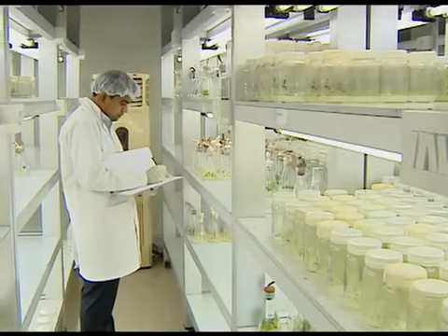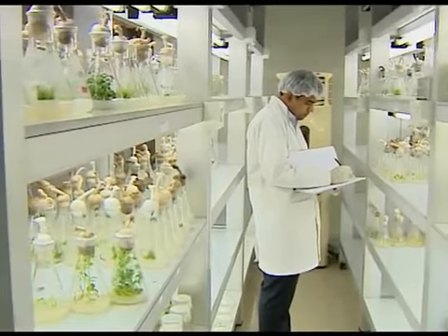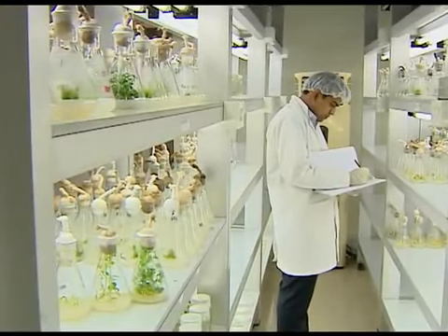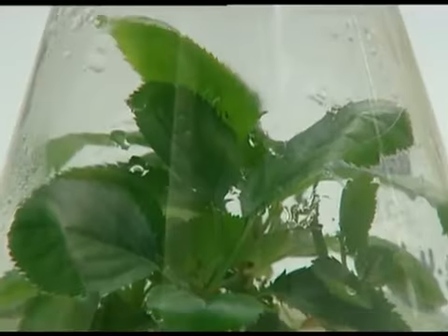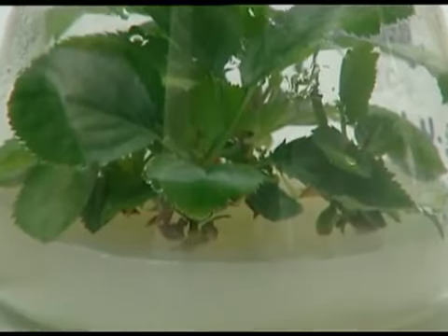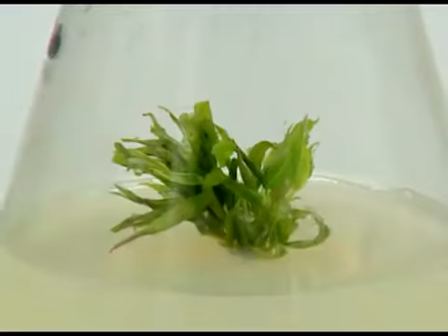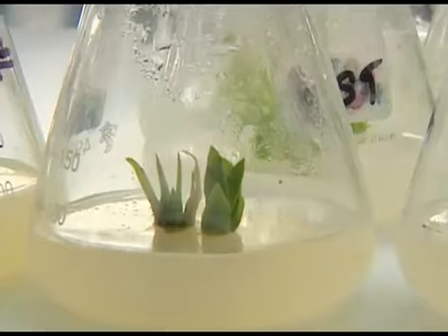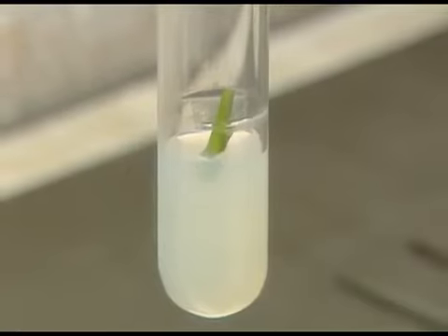Plant tissue culture is a collection of techniques used to maintain or grow plant cells, tissues or organs under sterile conditions on a nutrient culture medium of known composition. Plant tissue culture is widely used to produce clones of a plant in a method known as micropropagation.